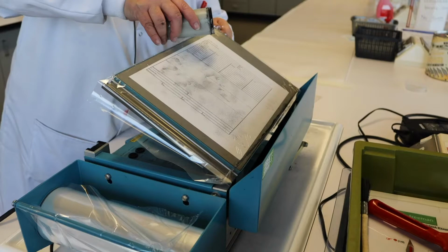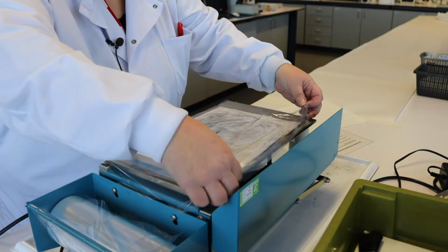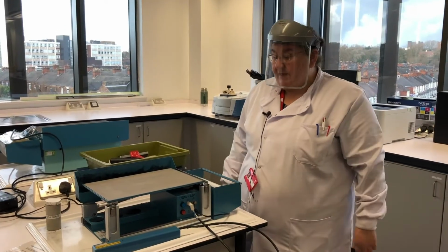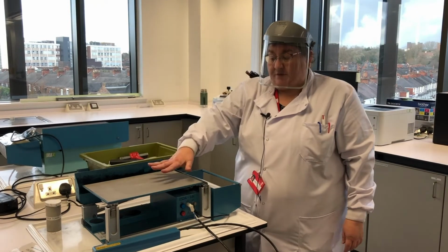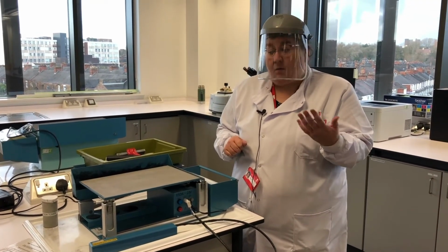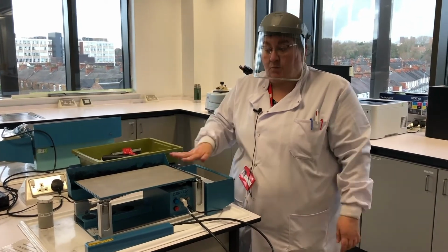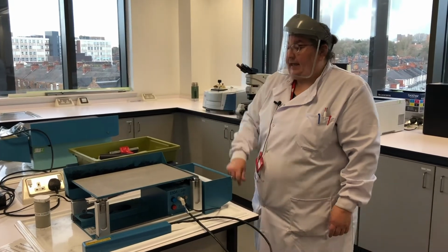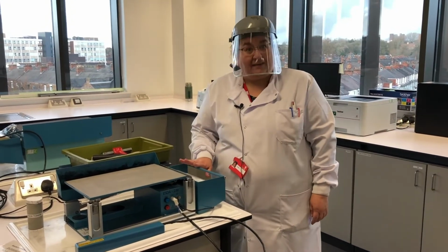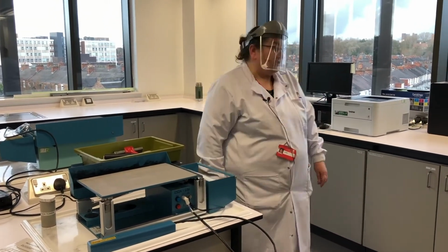This can then be highlighted with a carton of toner that we pour over the item, and that highlights the indentations on there. They can then fix it with a piece of adhesive sheet, and that is a piece of evidence that they can take away. They can also look at handwriting identification with that as well. We have two of those. They are quite portable, so sometimes we do take these out on days out when we go and do demonstrations.